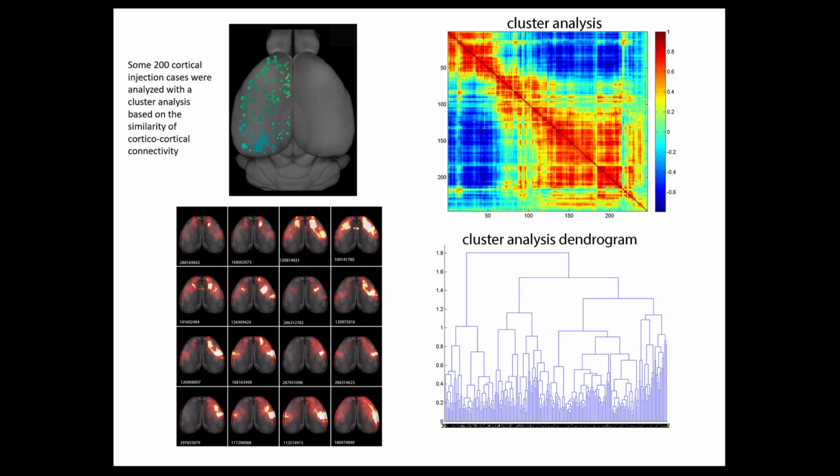However, one of the downsides is that the Allen Institute has quite large resources and a number of people, and it was a large study that involved many people to do. What we'd like to do is to be able to do this type of analysis within our own labs, and the NeuroInfo platform enables that.